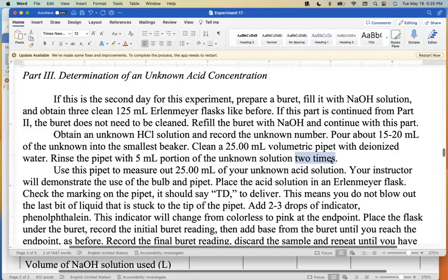I'm slightly on the neurotic side. When I was a student, I was always doing them 3 or 4 times each. That's because it's really hard to clean a pipette and make it dry. So what we normally do is we rinse the pipette with the solution that we're going to put in it so that the concentration doesn't get changed because of the water sitting in it. So we're going to go to the virtual lab.